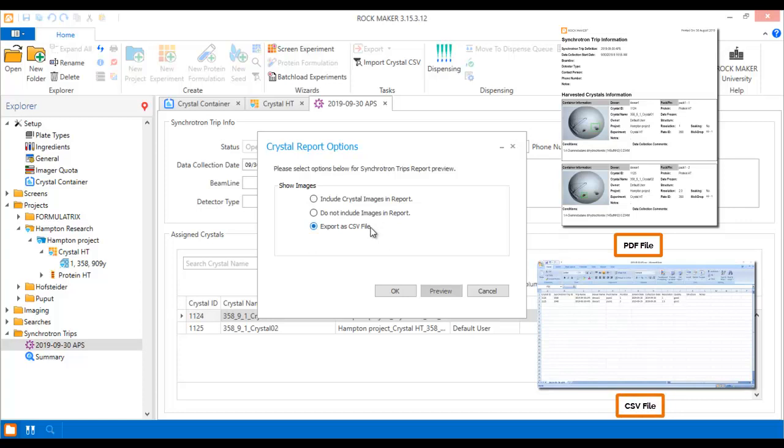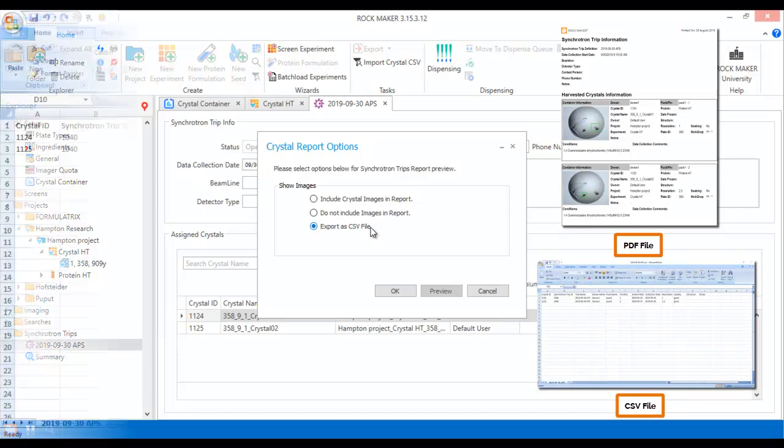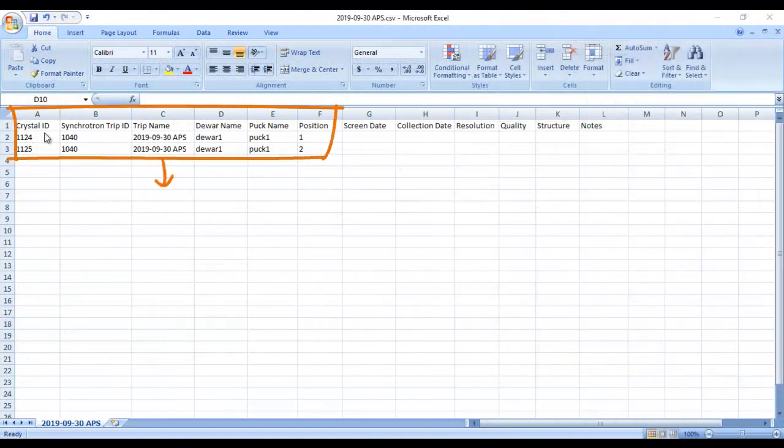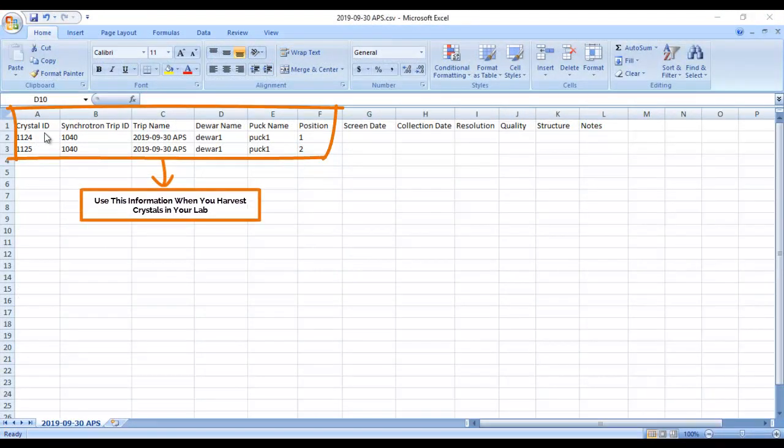You can print out the report after you virtually harvest your crystals in RockMaker and use it as a guide to help you locate the actual crystals in your incubator. The report contains the complete experiment, plate, and well information for each crystal, making them easy to find.